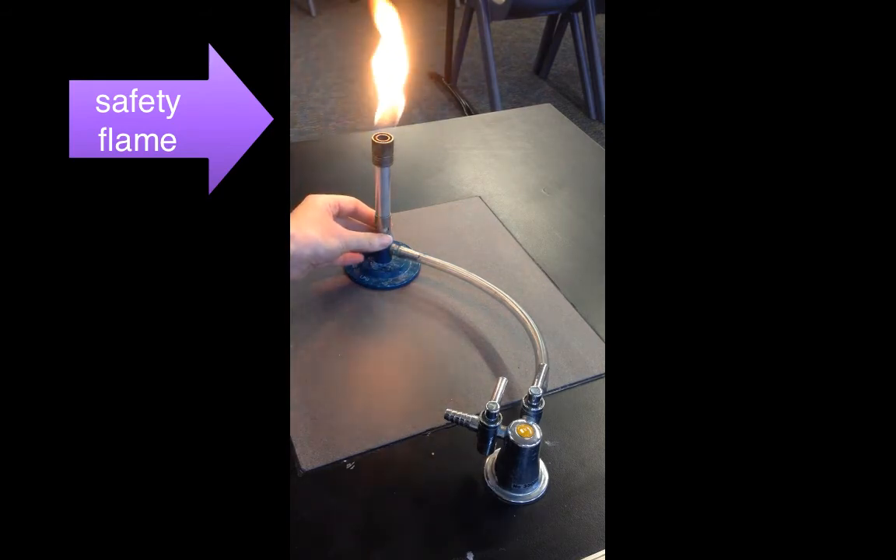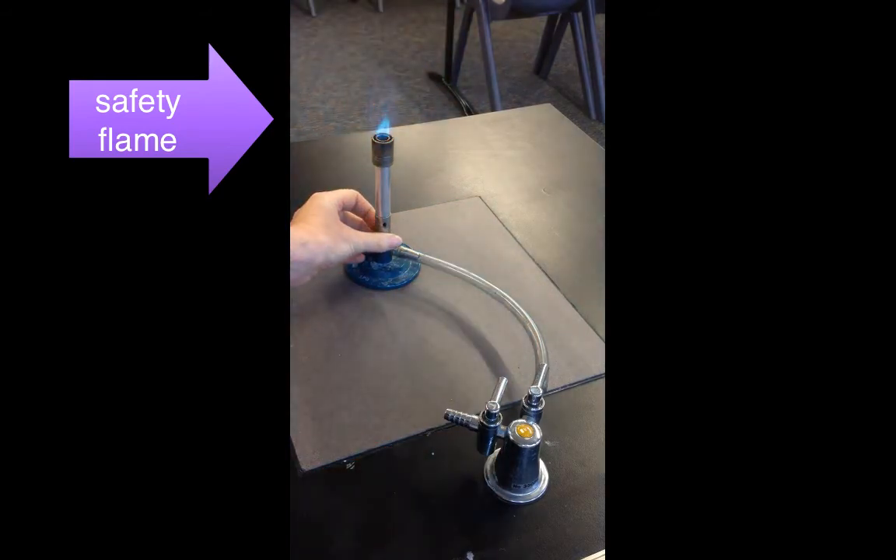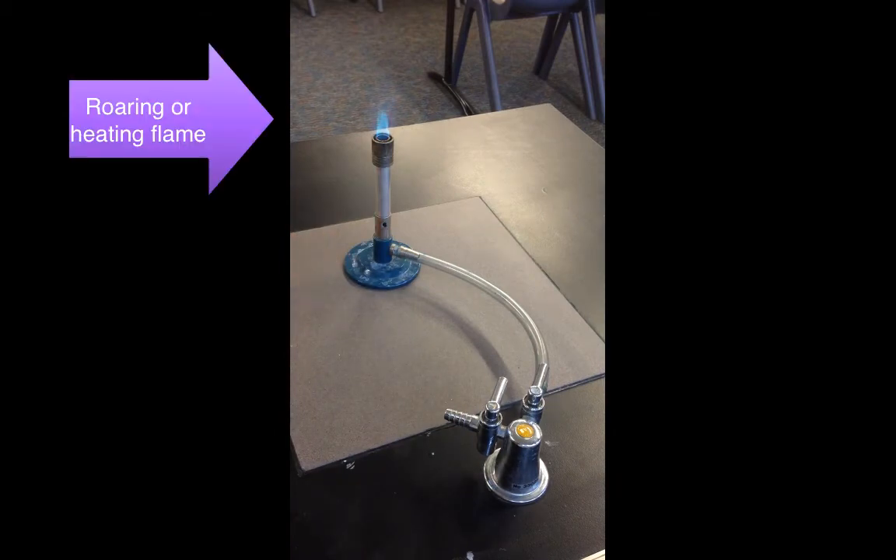When you open the holes so that more air and more oxygen can enter, you'll see that the colour of the flame has changed. There is now a light blue area and a bright blue area.